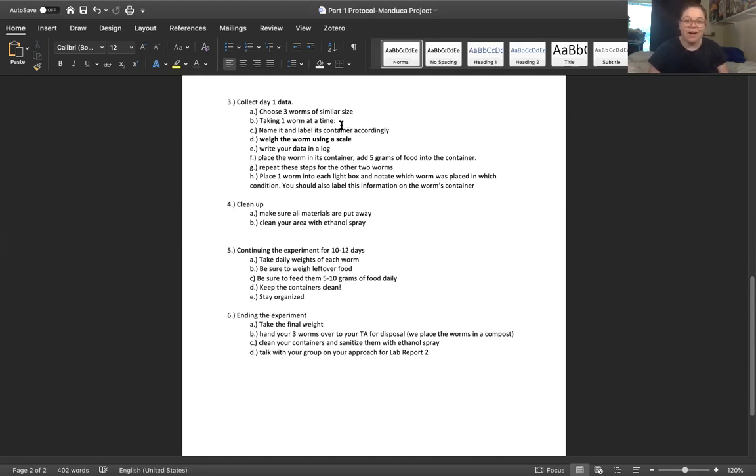They will move around, and then after you've weighed one, you'd be like, wait, which one did I just weigh, right? So you'll take one and you'll go ahead and name it. And I get some crazy names throughout the semesters. It's pretty fun. But let's just say, Mary, Jill, and Jack.